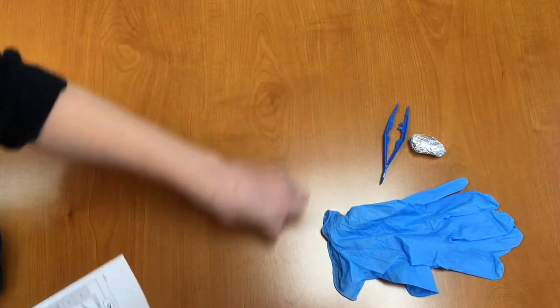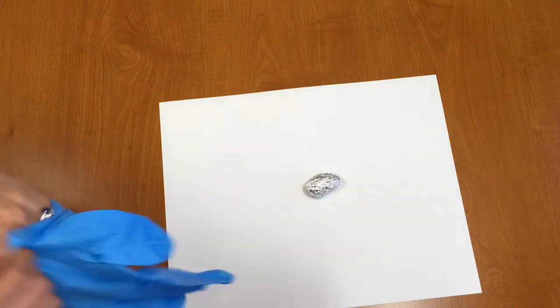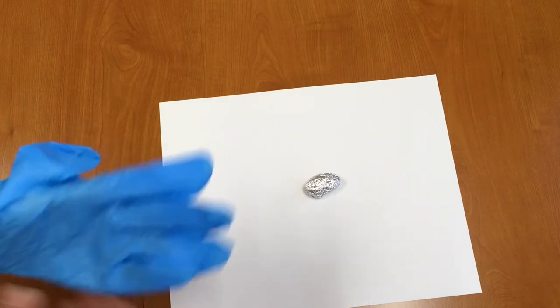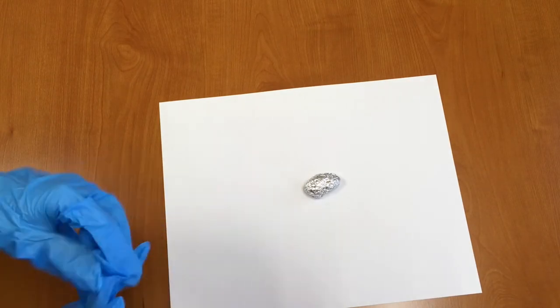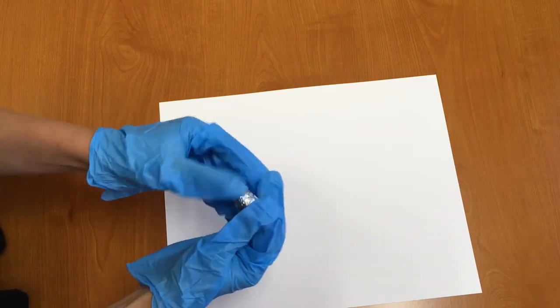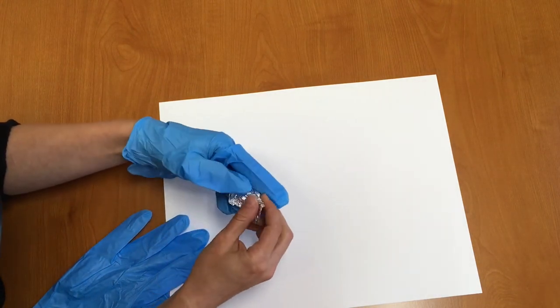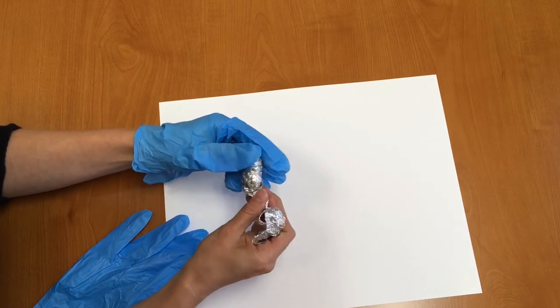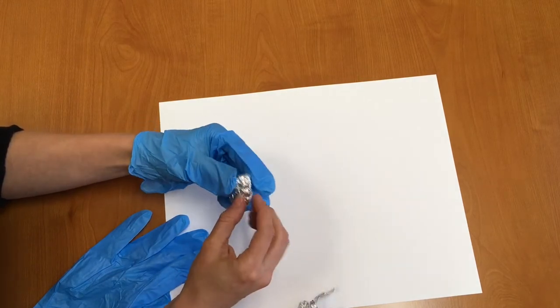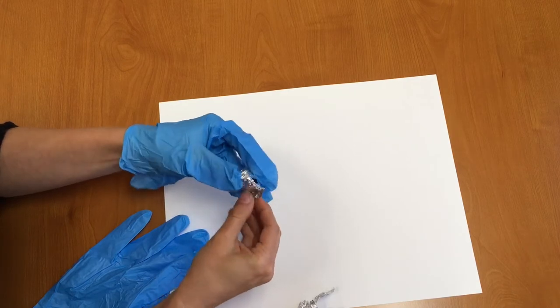Before you begin you want to lay out some newspaper or a piece of paper to put your owl pellet on. Next, put on your gloves — my gloves are a little bit big for me but that's okay. Now we're going to unwrap our owl pellet — just take all the tinfoil off of it. It might be kind of hard to find the seam but if you pick around for it a little bit you can find it.